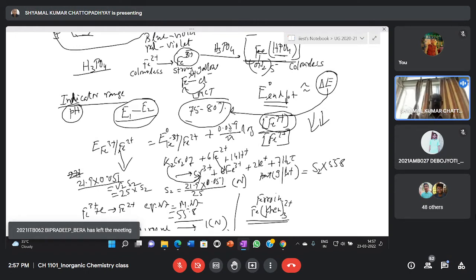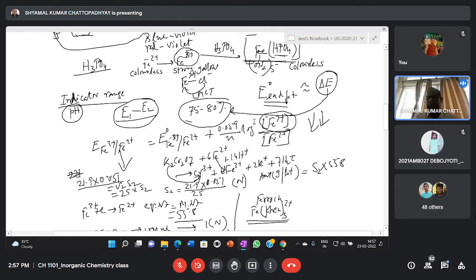So I repeat, what is our second objective? We are adding phosphoric acid with the assumption that phosphoric acid will form a complex with the ferric iron. This will first of all make it colorless, so its interference during endpoint detection is diminished. And second, by removing ferric ion in the form of complexation, we are decreasing the free ferric ion concentration. As a result, overall redox potential is decreased during the endpoint, and so now the endpoint will occur at a redox potential where it matches with the indicator range of the BDS indicator.